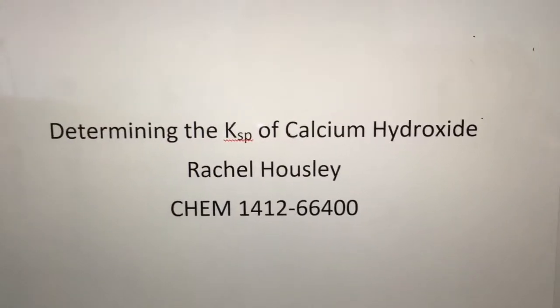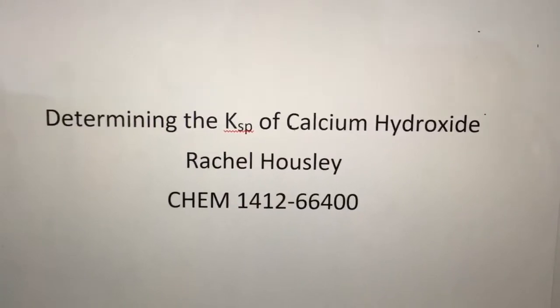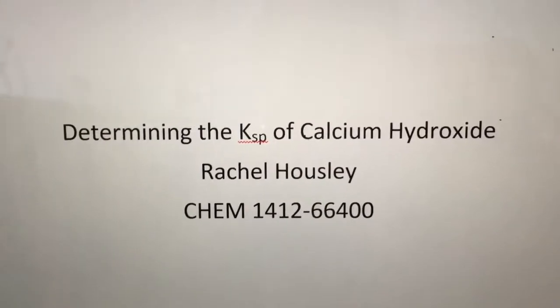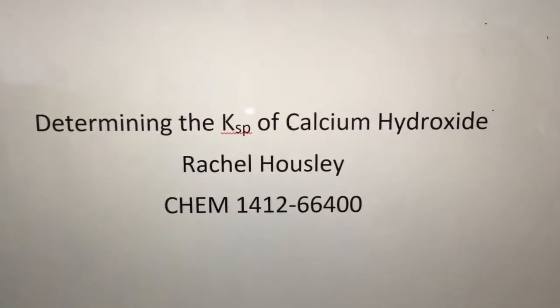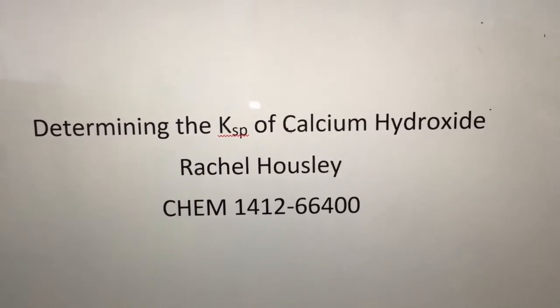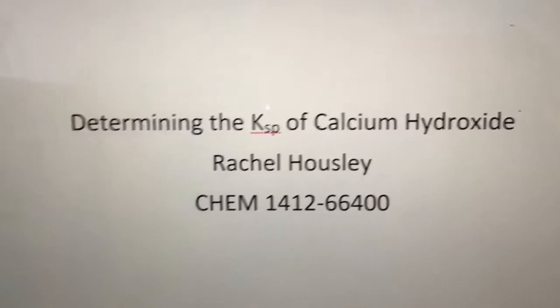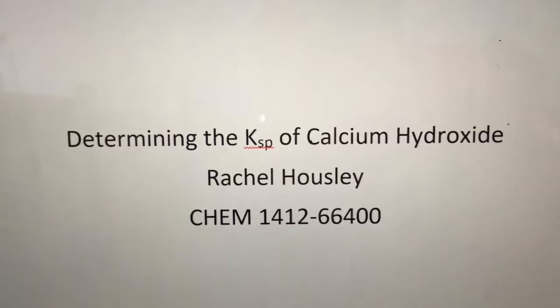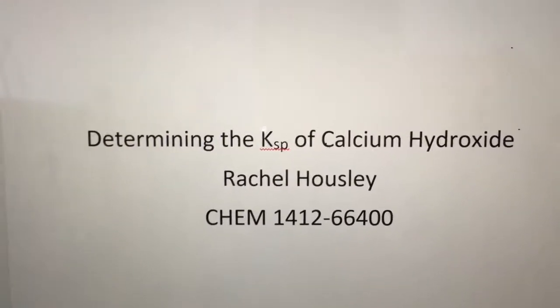Hi, this is my lab video, lab number 7 for Chem 1412, determining the Ksp of calcium hydroxide. So Ksp is the solubility product, and during this lab I will be finding this value for calcium hydroxide through a titration using hydrochloric acid.